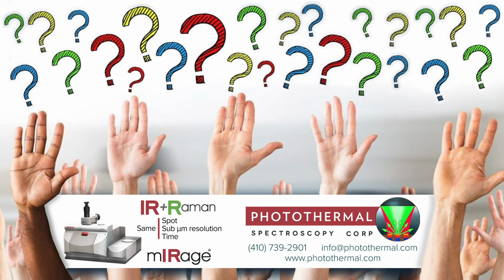I'll move on quickly. This is probably for you. It says, were the spectra you showed of the stem cells on O-PTIR class averages or individual spectra? The O-PTIR spectra were individual spectra from a single point. So that means a single spectrum from the glycogen, a single spectrum from the cell body, and also a single spectrum from the 200 nanometer membrane.